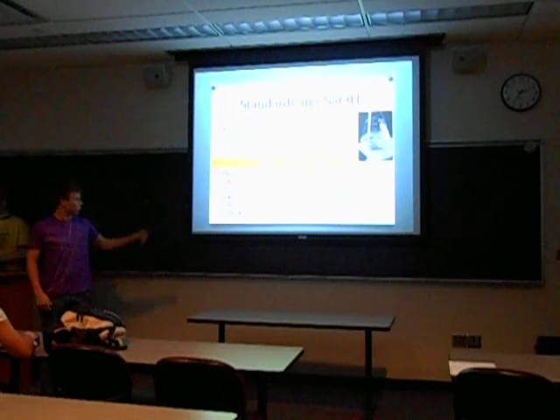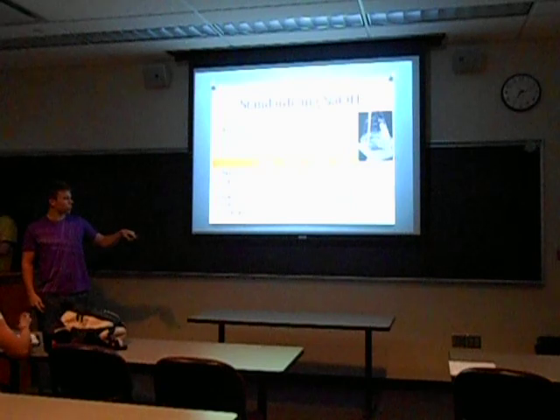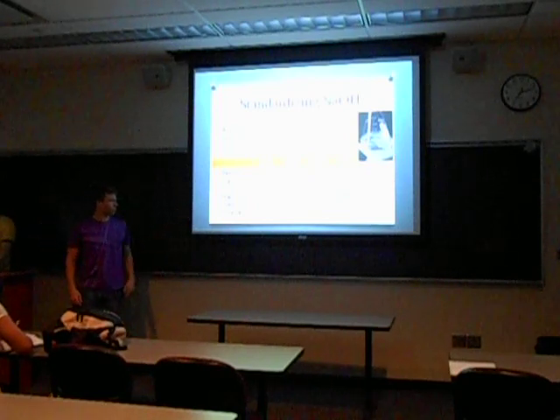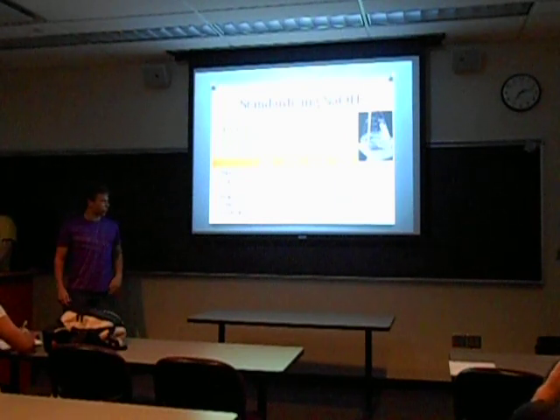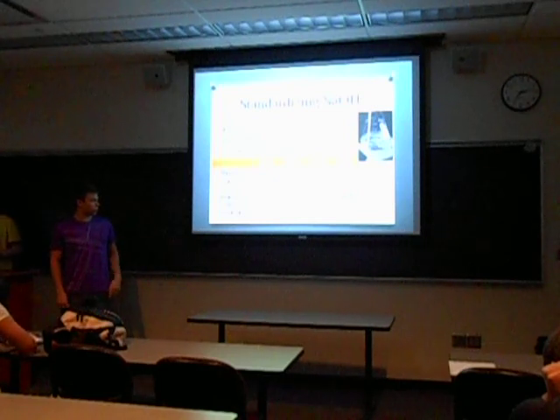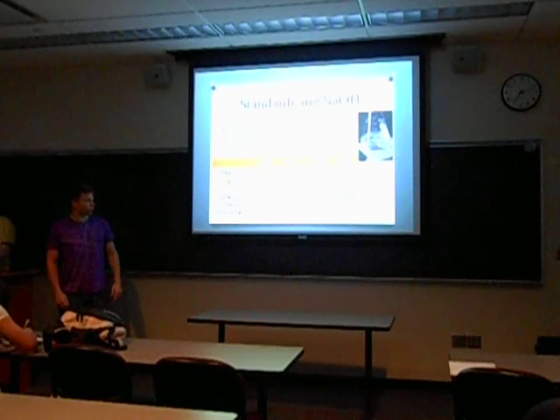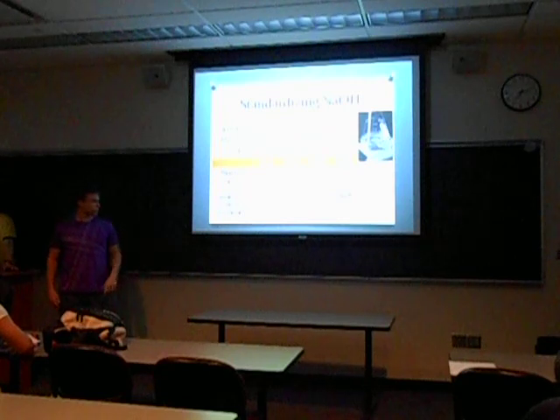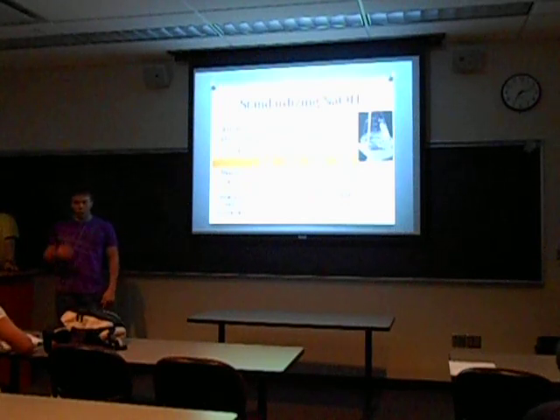And for our data, we had the mass of each KHP we did. We started off with a rough trial, and then we had trial 1, trial 2, and trial 3. Those are the initial readings, starting here and finishing with 16.28 milliliters used, and gradually going down, starting off with 16.50, ending with 33.85 milliliters. Then we refilled it to start with 1.50 milliliters and finished with 19.85, and then again with 19.85, finished 37.51. The important thing was to figure out the volume of NaOH used, which are the values on here. So roughly 17 milliliters of NaOH was used per titration.